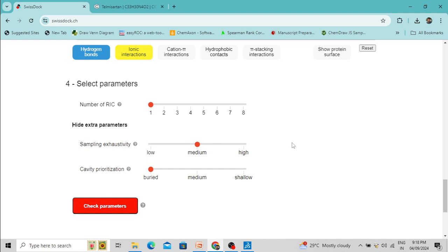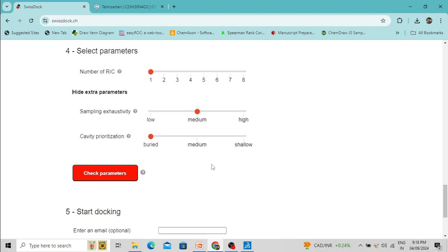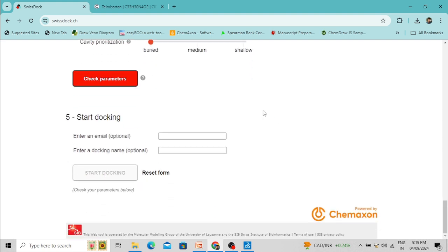Two extra parameters are also available: sampling exhaustivity and cavity prioritization. Exhaustivity means how deeply this docking algorithm will search for the appropriate docking conformation. Cavity prioritization relates to whether the active site cavities are buried deep within the protein or present on the surface — depending on the protein structure, you can change this option.